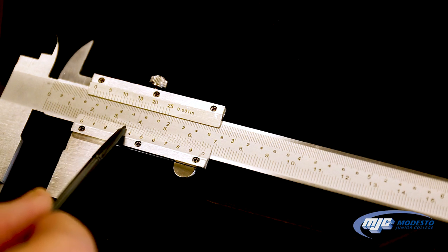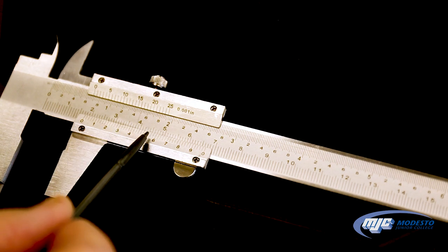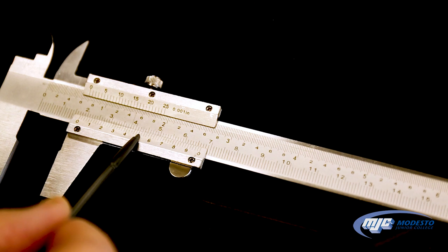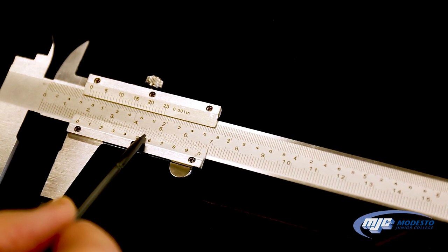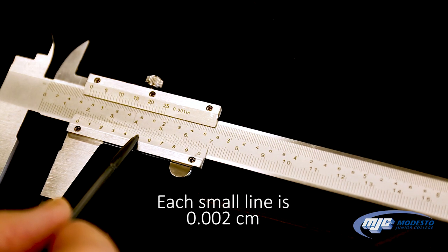But as we go over, we get to the five, it starts getting closer. And then I'd probably say that, and each of these small lines, by the way, is 0.002 centimeters.